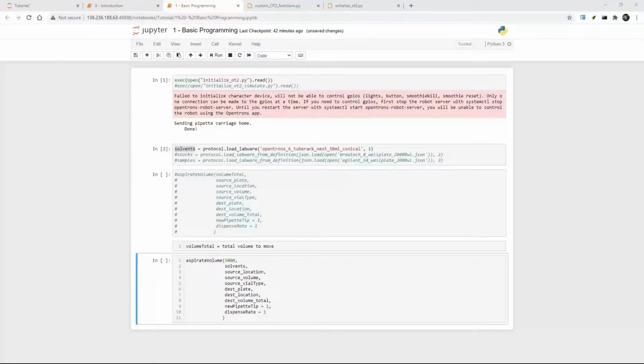So what we'll do is when we go back to Jupyter, say, okay, source location. So now this is important. You need to add 2 quotes here because if you know a little bit of Python, the locations are stored as strings, and we'll get into this later for the intermediate stuff. But all we need to know for now is just we're going B1 and source volume. Okay, so source volume is the volume of the source file before you start doing anything.